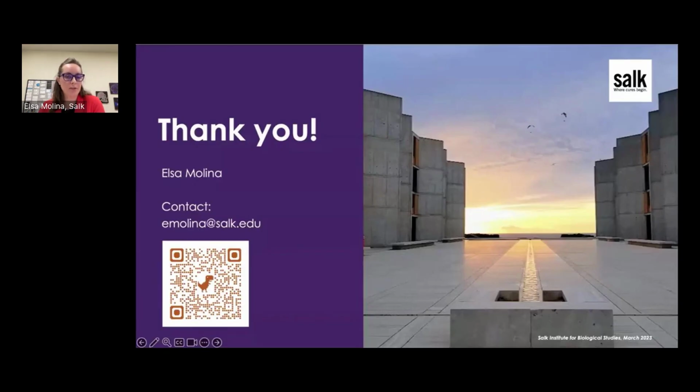some researchers, depending again on the research question, might not care if the resolution is not too deep. You know what I mean? Sometimes they just need not a very deep resolution, and some researchers really need to know inside the cells, if transcripts are in the nucleus or in the cytoplasm. So it really depends on the research question, but I really hope that we will have a deeper resolution.